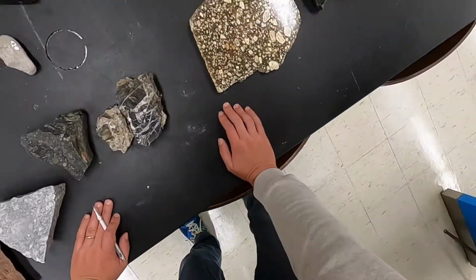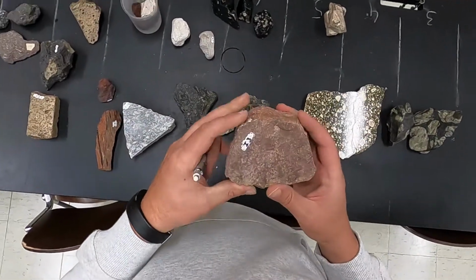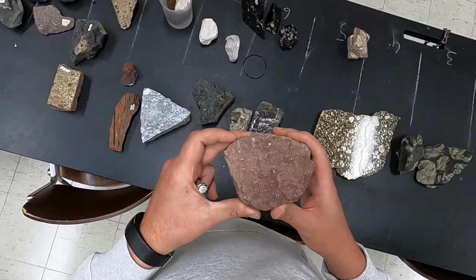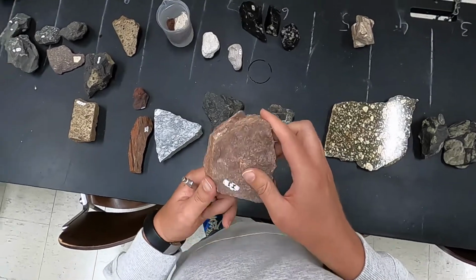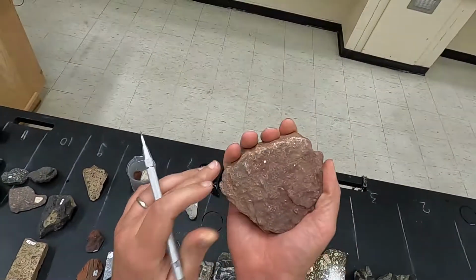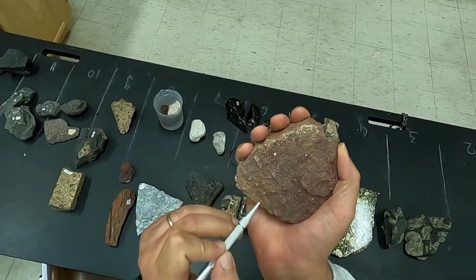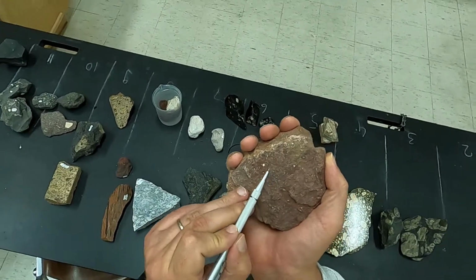I think I'm left with this other specimen, which is characteristically reddish in color. This could be either a product of weathering or really evidence that you have quite a bit of K-feldspar in this rock. I would carefully look at the rock with a magnifier, and we will do that and try to identify some of the mineralogy, and I can definitely say that there seems to be some K-feldspar in this rock.